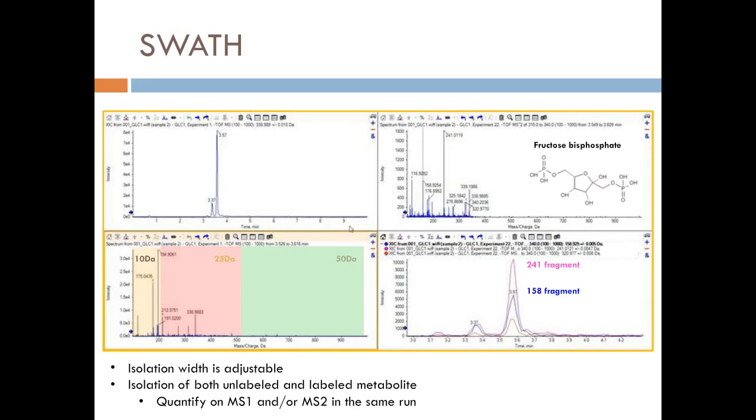So why would that be important? For us, it's important because it allows us to follow the fragmentation pattern and see what's falling off and be able to know that we've lost one carbon or we lost two carbons and build that information together. It's very important for unknowns in that regard. And having this flexible window allows us to put those two in the same SWATH window and collect that information downstream and then do post-processing to analysis.